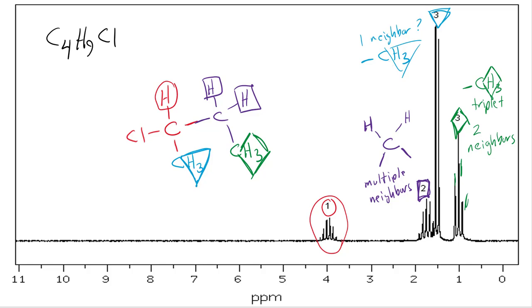And when we think about this, we notice that the two square hydrogens and the triangle hydrogen are actually equidistant from the chlorine, which is why their signals are so close in chemical shift. So again, we've deduced a structure given an NMR and a formula, and we've made assignments or correlations between signals in the spectra and the atoms in the molecule that produce them.